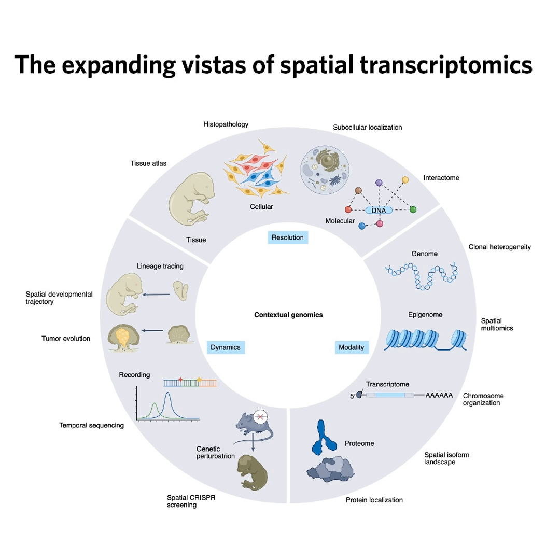Right. If every lab developing or using an SST technology ran these same reference samples using agreed-upon metrics, we could finally start speaking the same language regarding performance. We could properly benchmark sensitivity against, say, single-molecule FISH references and quantify that blurriness from diffusion by measuring feature sharpness. Standardization sounds crucial. Okay, let's pivot now to the other family, imaging-based ST or IST.